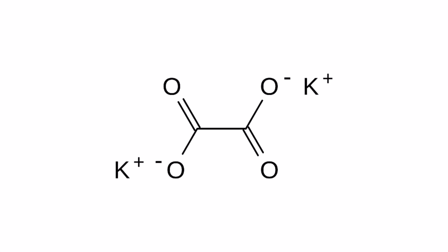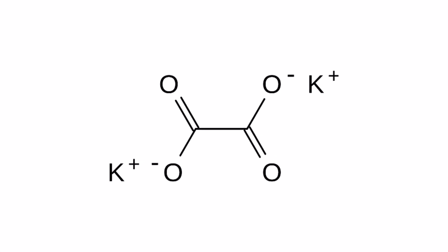Hello dear viewers. This time from this substance, potassium oxalate, we will make this gas, carbon monoxide, that burns with a pretty blue flame. Stay tuned and have fun watching.